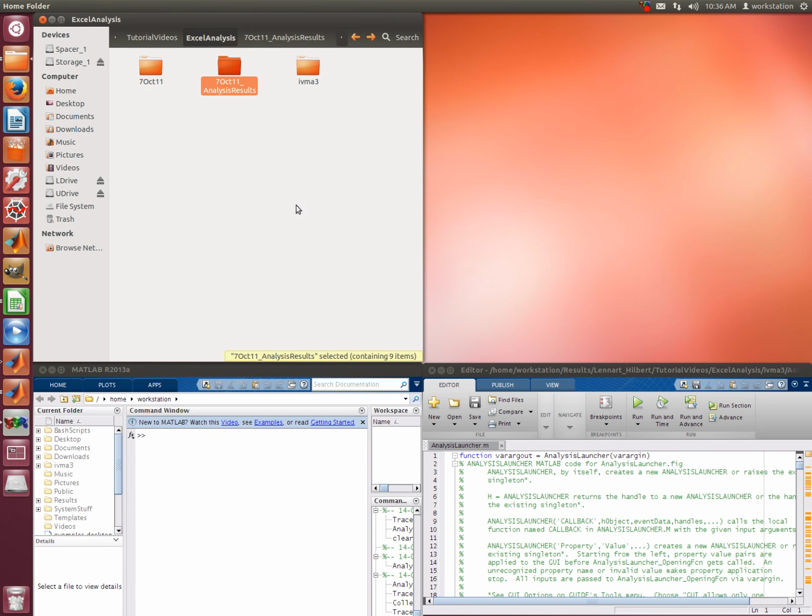Welcome to the second tutorial. We're going to be picking up from what we did, well, for me it's actually yesterday. You might be looking at this just a minute after. But yesterday, in the first tutorial, we used the analysis launcher that is still open here in the bottom right.